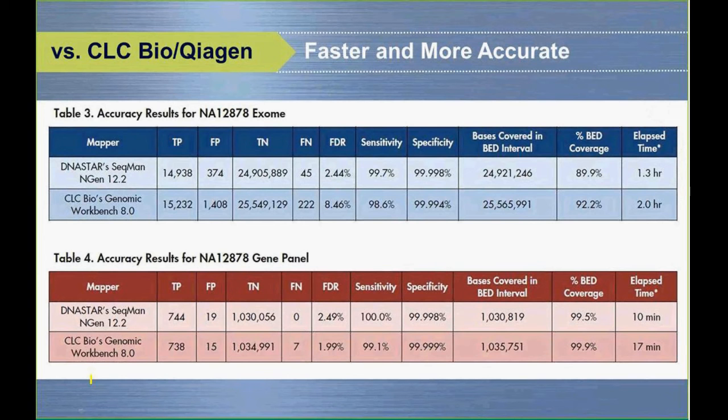And of course, it's the same software. You don't use a different algorithm between our targeted resequencing that produces these results and our RNA-Seq and ChIP-Seq. It's all the same algorithm. It works the same way. So you get the same benefits. You don't have to switch to a different algorithm for these different data sets that ultimately you may want to compare to each other.